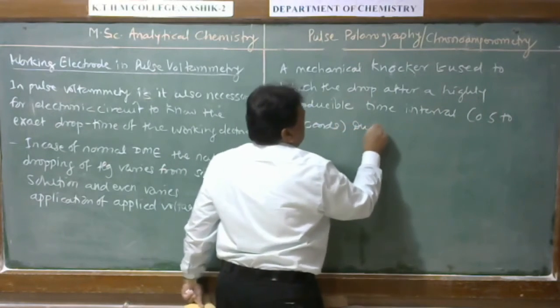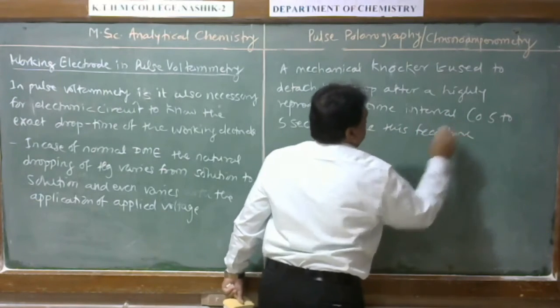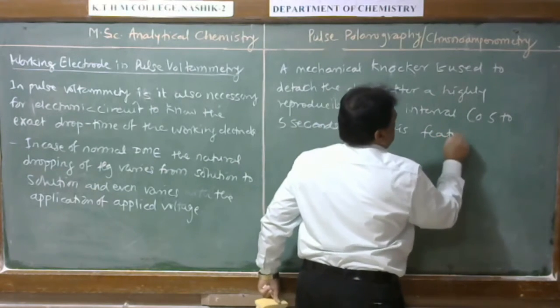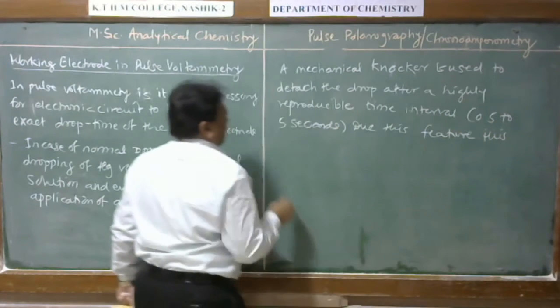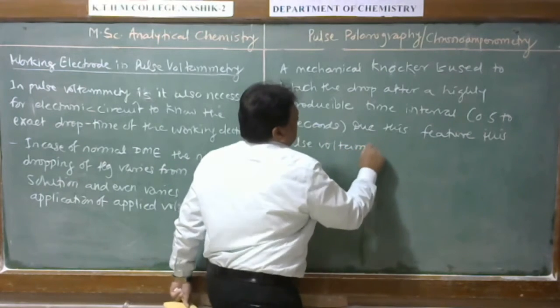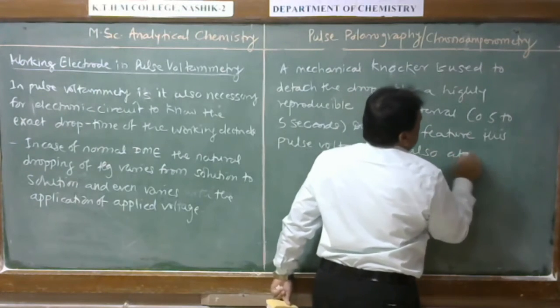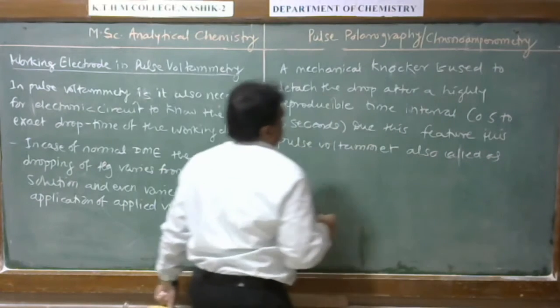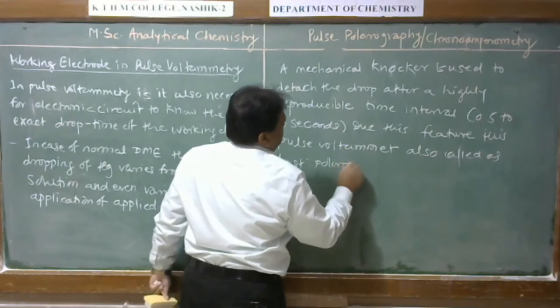Due to this feature, this pulse voltammetry is also called tast polarography or tast voltammetry.